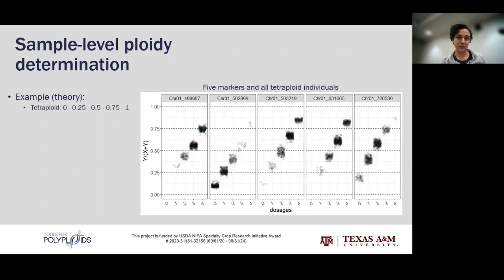And so I started trying to understand what was happening. It turns out this assumption is not true for the data. It's not necessarily on zero for every marker. So the dosage here was called by fitPoly, and this is the ratio. You can see, for one marker, each dot is an individual sample.